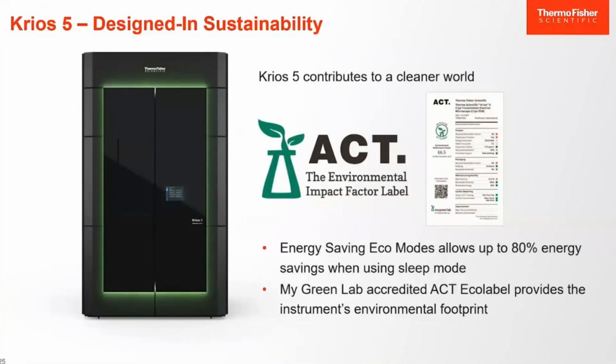So that is with respect to tomography. In the last part of my presentation, I would like to talk a little bit about a completely new aspect, but a very important one, and that is sustainability. We all know that electron microscopes are very energy consuming. As a rough rule of thumb, the average energy consumption of a Krios electron microscope is around 35 households, if they consume 2,500 kilowatts per year. So it's important, we thought, to cut down the energy costs.